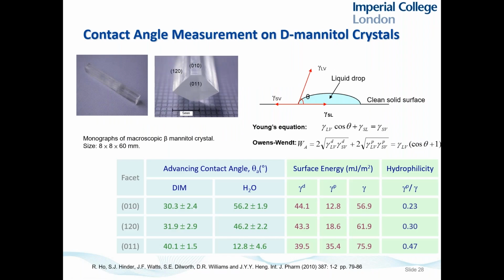So the first thing we did is contact angle measurement, and I'm not sure if you're familiar with that, but let's talk about it briefly. We put a droplet of a liquid on the surface. We typically use two different liquids for that. We use a liquid that does van der Waals interactions only, called diiodomethane, summarized here as DIM. It just measures long-range van der Waals forces.